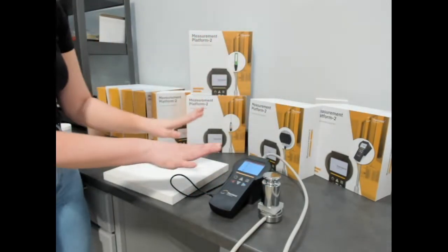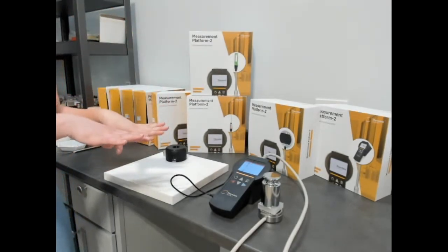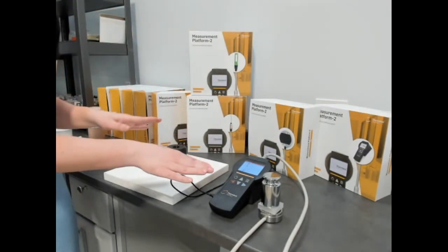That's all there is to setting up a measurement with the MP2 itself. We're now going to move over to the software and review some data that we've measured previously with the polypropylene.